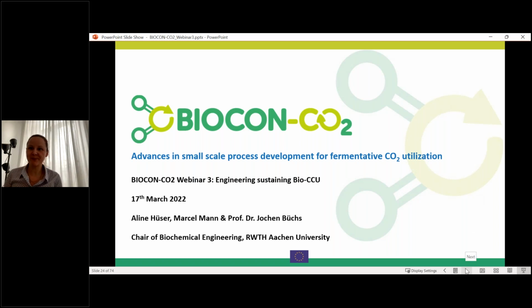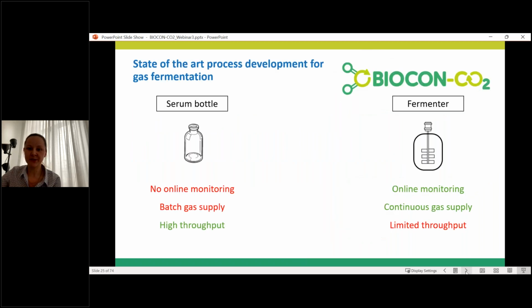So yeah, welcome to the next presentation. And I'm happy to tell you a little bit about our advances in small-scale process development for fermentative CO2 utilization. You can go, yes, thank you. If you look at the state-of-the-art for process development for gas fermentation, there are basically two systems we are using, which on the one hand is a serum bottle in the small scale, and the next one is just the fermenter in the next bigger scale.